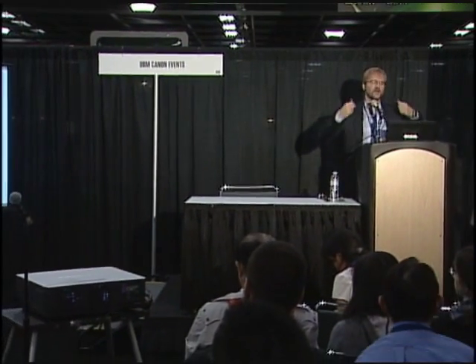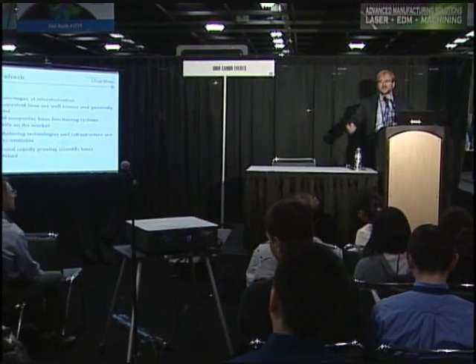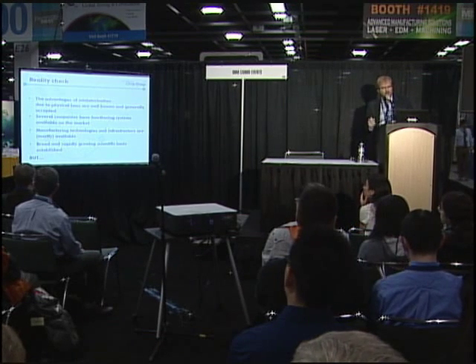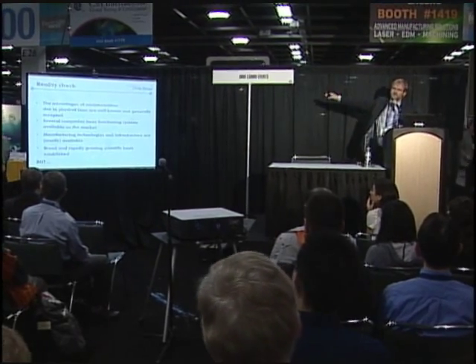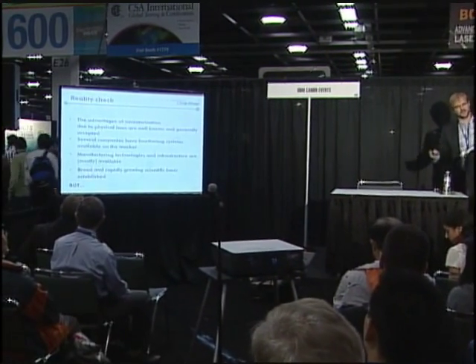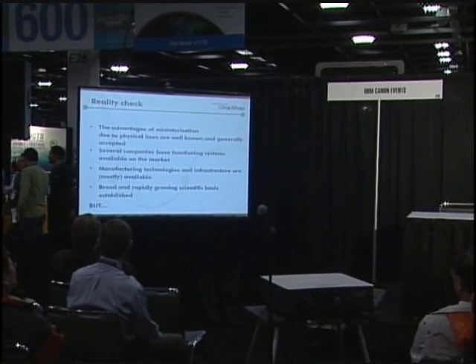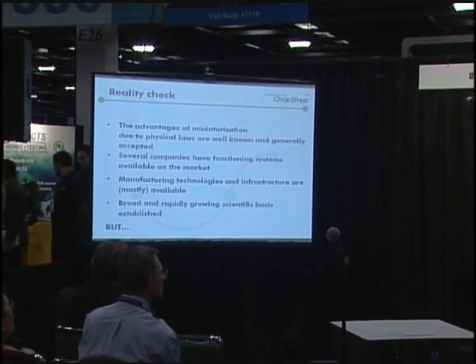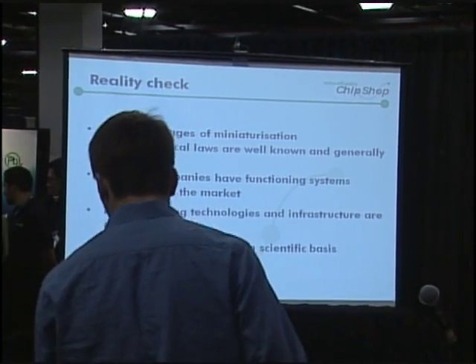Let's do a reality check, because of course microfluidics 10, 15 years ago has been hailed as the next big revolution. We're going to revolutionize the life sciences and diagnostics and the way analysis will be made. Well, if we look into where we are at right now, one of the things which I found really important is 5 years ago my first 5 slides would always be, why does it make sense to miniaturize? What are the advantages? What are the scaling laws and stuff like that? That discussion is through. Now, really everyone accepts, even in the fairly conservative markets like diagnostics, the advantages of miniaturization. The scaling laws are known, and it's no big deal anymore.